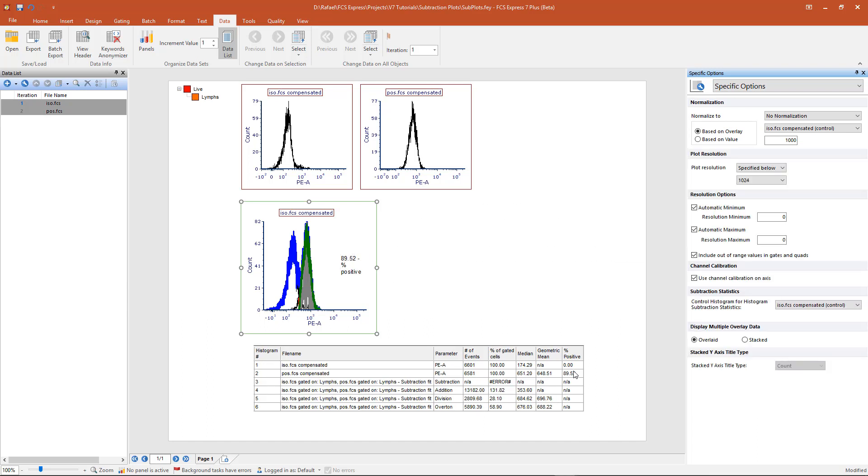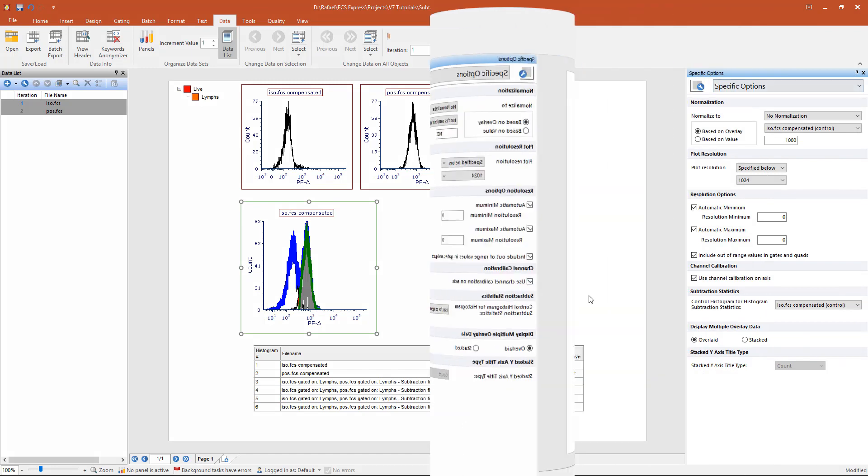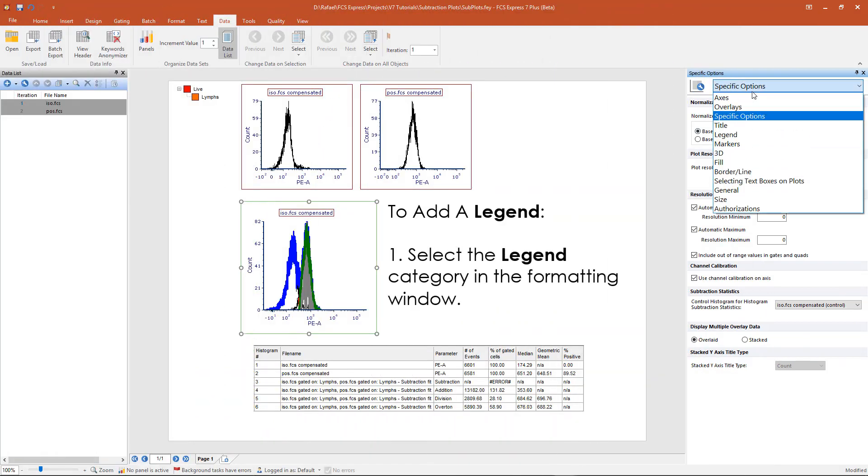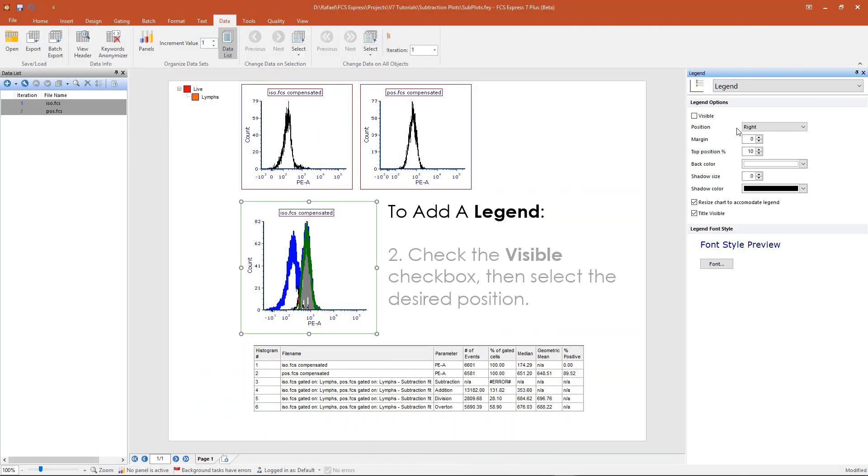A full description of these different statistics can be found in the FCS Express manual section on subtraction plots. A legend may also be added to subtraction plots from the legend formatting window.